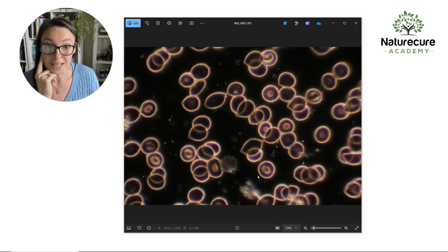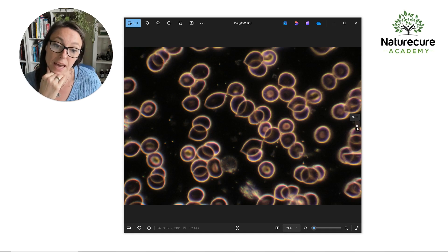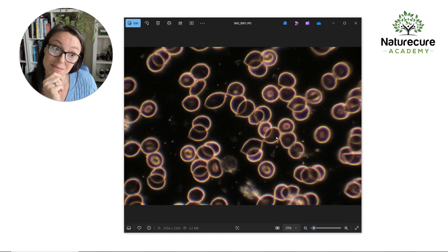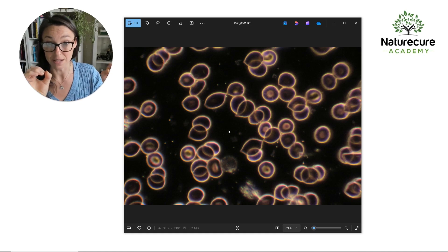So here I'm just going to quickly go through some of these images. One thing I noticed when my client came is how these blood cells are connected like a chain. Normal healthy, well-functioning, balanced blood—optimal blood—wouldn't have this. What we want is our blood cells to float around separately. They aren't supposed to be stuck together.